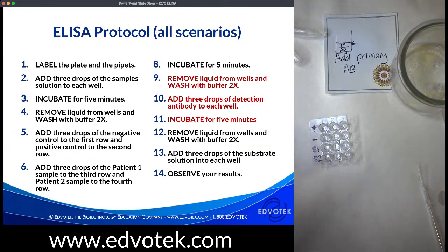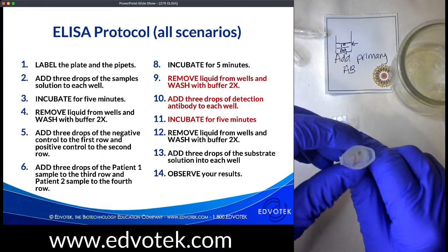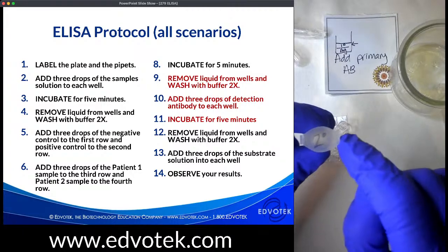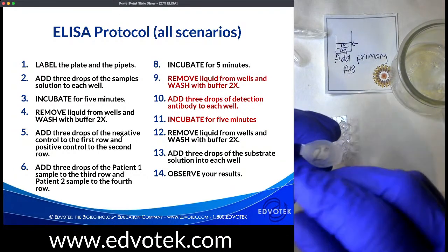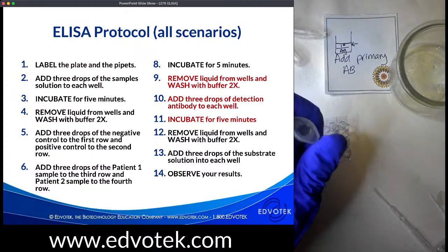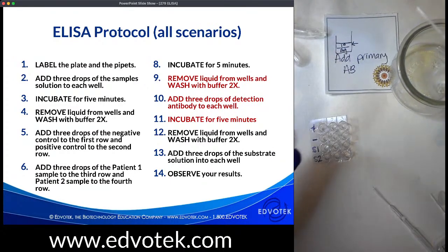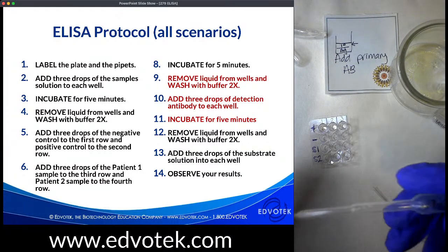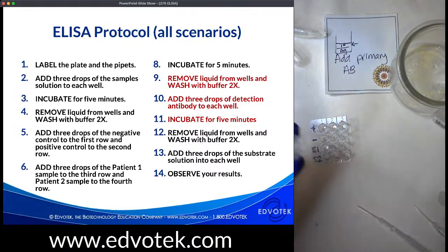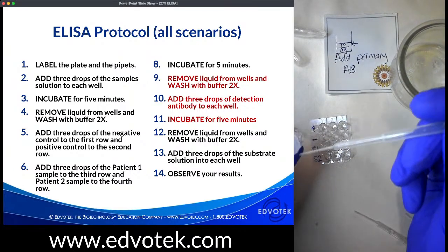analyzed by ELISA. Let me just explain what I'm doing next and then I'll come back to your questions. So this is going to be our secondary antibody. Remember, this is the antibody that's a polyclonal. It's going to recognize multiple sites on our primary antibody as we're setting up this complex in our mini test tubes. So I'm going to add this secondary antibody to all of my wells. If I can find the right pipette, this is my ABTS. Here's my secondary antibody. Did I use this already? I see some residue in my secondary antibody pipette. I'm just going to grab another one just so I don't make any mistakes.